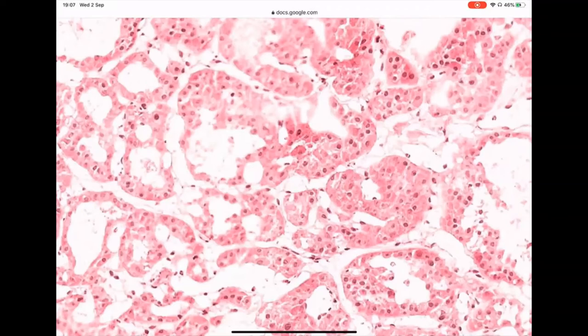If you are quite confident that this is an oncocytoma, you tell the surgeon, I think this is a benign tumor, which is oncocytoma. Either you proceed with surgery or not, it is up to you. I am not in a place here to decide more than what I have told you. This is an oncocytoma, which is a benign tumor. Don't say good prognosis or bad prognosis or anything. You don't know, because do you know where it is? Do you know if it is compressing on the renal pelvis or not? Some oncocytomas can be 7 or 8 centimeters. This is not something for us to decide.